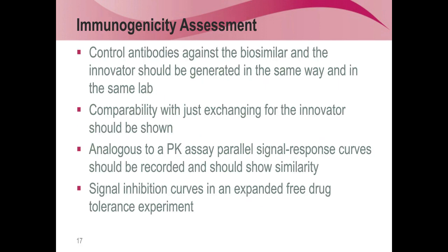What has basically crystallized for us now, as a gold standard, is that we do two main experiments. And that is why it's very important, if you want to place a bioanalytical assay with us, that you come to us very early, because we usually recommend that you generate polyclonal antibodies against the biosimilar and the innovator in the same lab, and we will take care of that, based on the same immunization schedule and so forth.